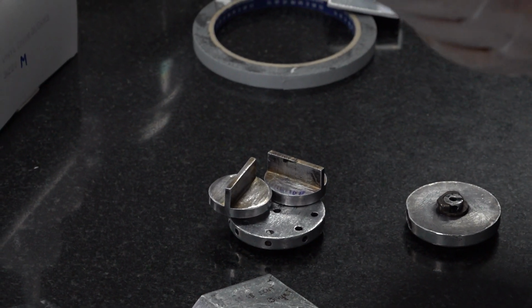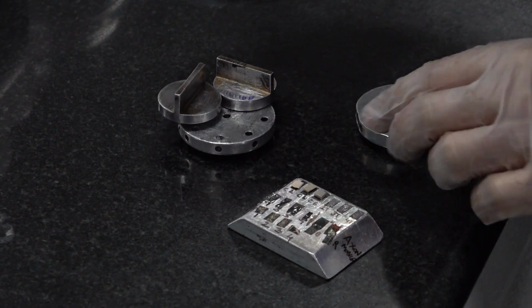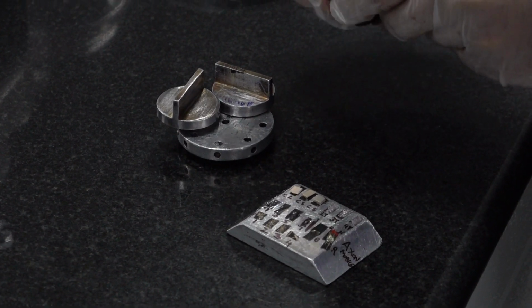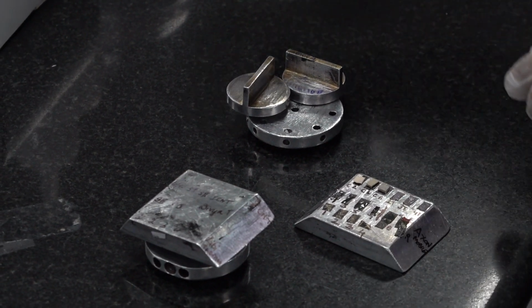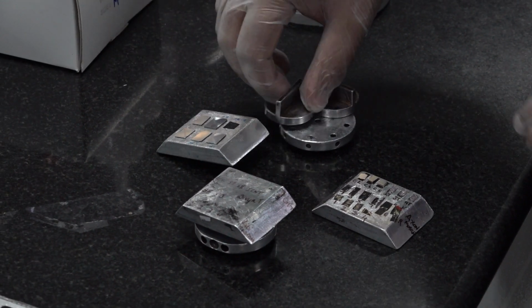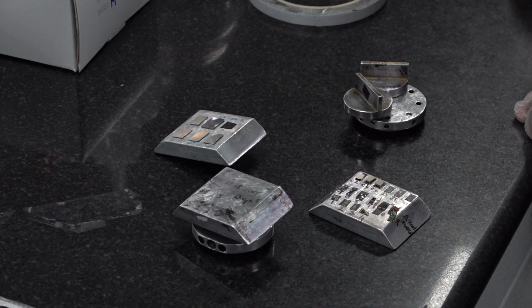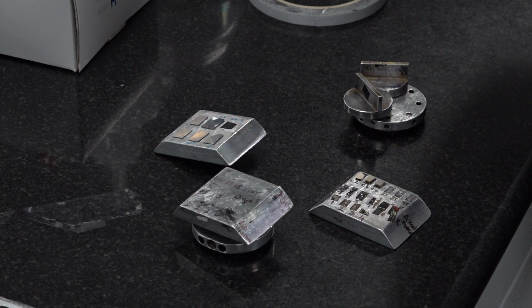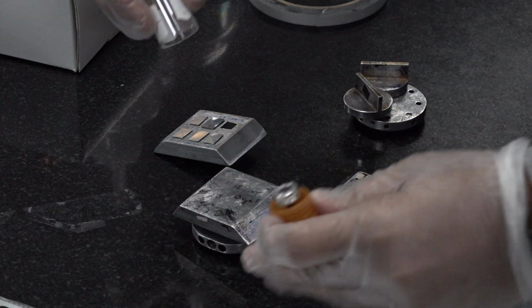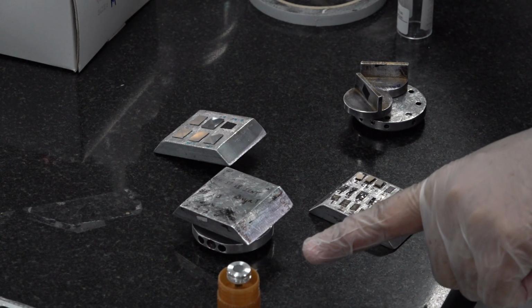So today, as you have already seen, we have different kinds of samples. We have some films here, some films here, powder samples, and thin films. And these are different kinds of holders which we use. Today for our demonstration purpose, I am going to use a gold on carbon standard sample. This is your gold on carbon standard sample.